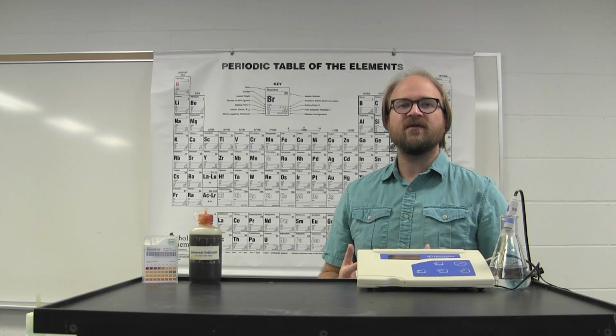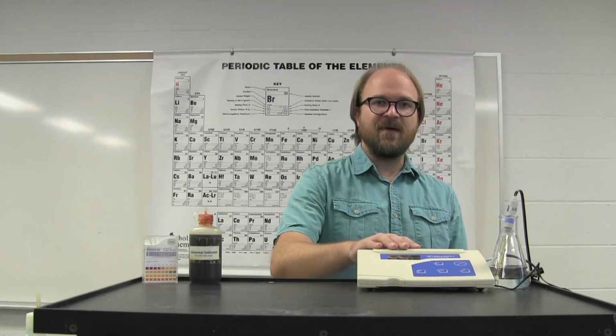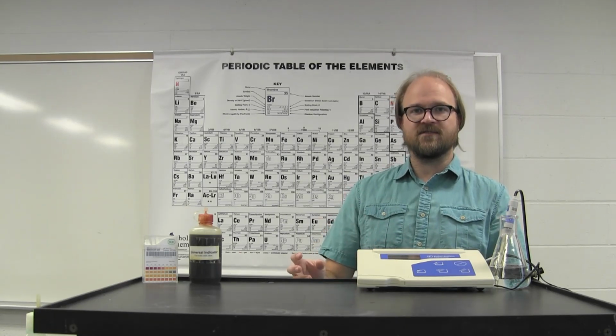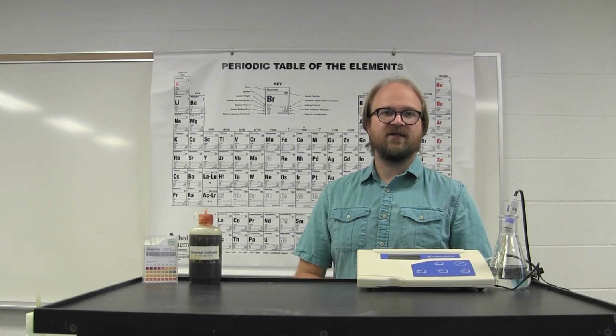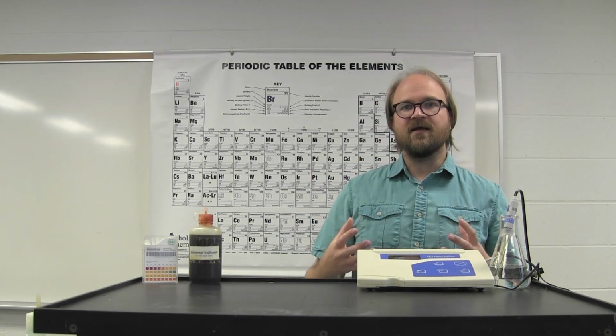In the end, this experiment predominantly looks at measuring the pH of a number of different solutions and converting that into the concentration of acid, that H+ concentration, as well as the concentration of base, the OH- concentration. You're also looking at, from the pH measurement itself, developing the Ka and Kb for varying solutions of weak acids and weak bases. What is the equilibrium acid dissociation constant or the base dissociation constant? And finally, you're looking at preparing buffers, which are resistant towards a pH change. You're figuring out which ones are better for acids, which ones are better for bases, and overall getting a good sense of what buffers are actually comprised of and what they actually do.